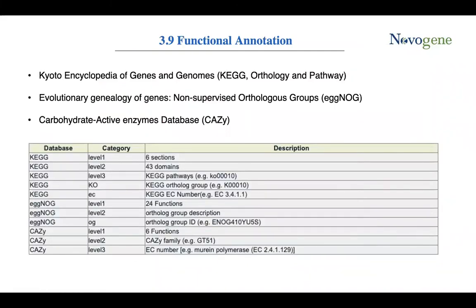And the metagenomes provide insight into the physiology of a community by clarifying the collective functions. So those functions are also encoded in the genomes of the organisms that make up this community. The functional diversity of a community can be quantified by annotating metagenomic sequences by using several databases. The KEGG database is currently developed into a comprehensive database.